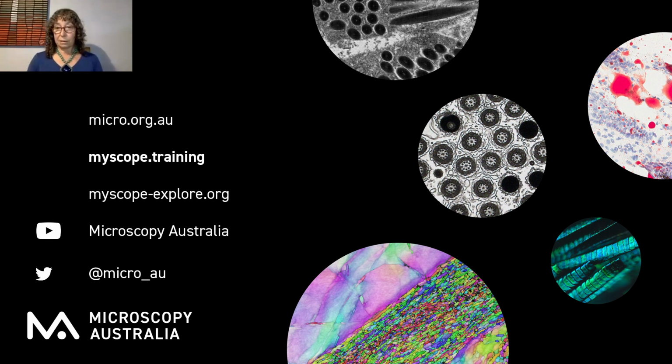Okay, let's see, what else do we have? Any plans to expand with EBSD and WDS? EBSD is something that we are thinking about, that we could move ahead with in the future, but there is a long list and we only have one developer, and we have a lot of our staff put in the content, but they obviously do that in addition to their normal work.